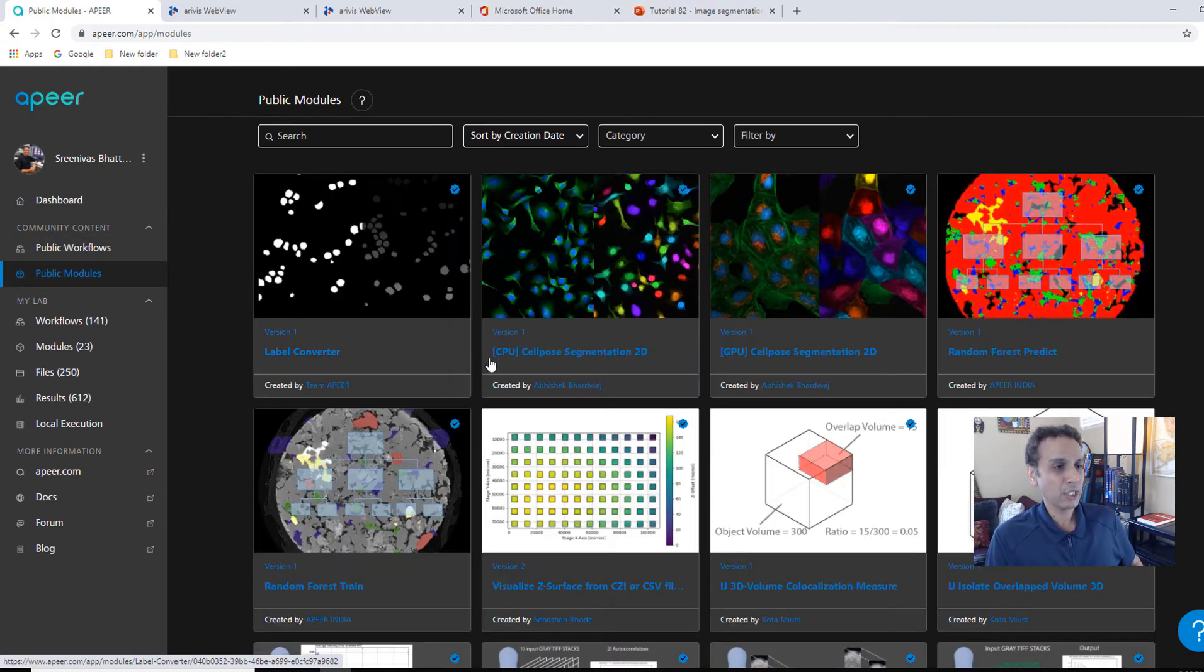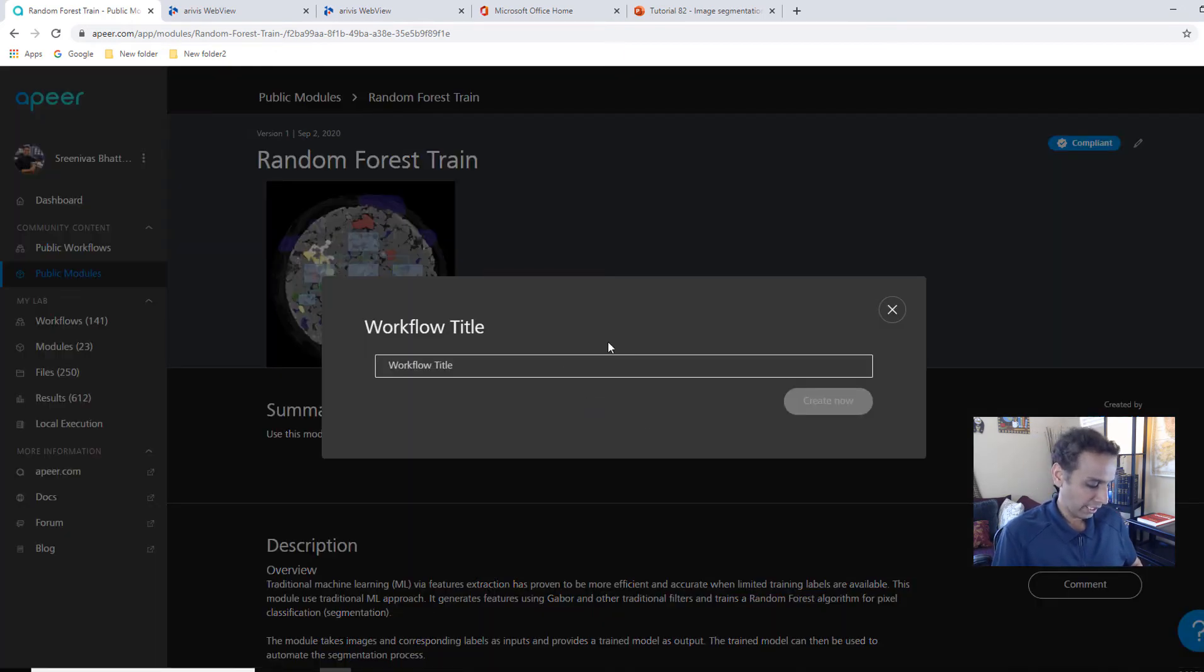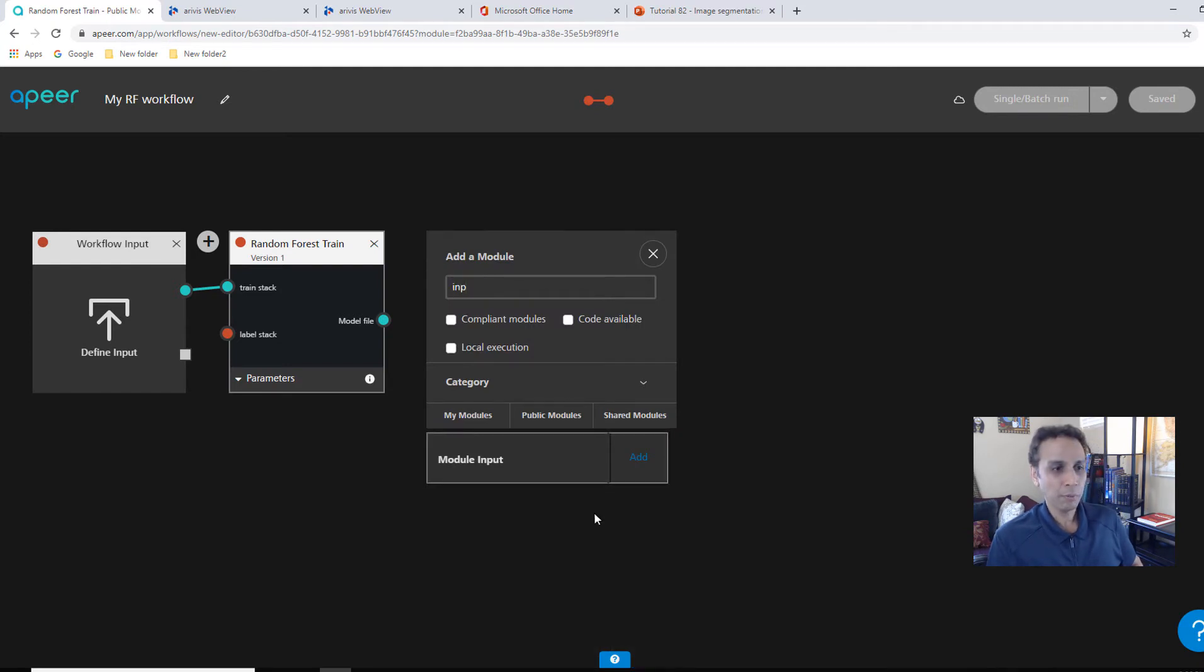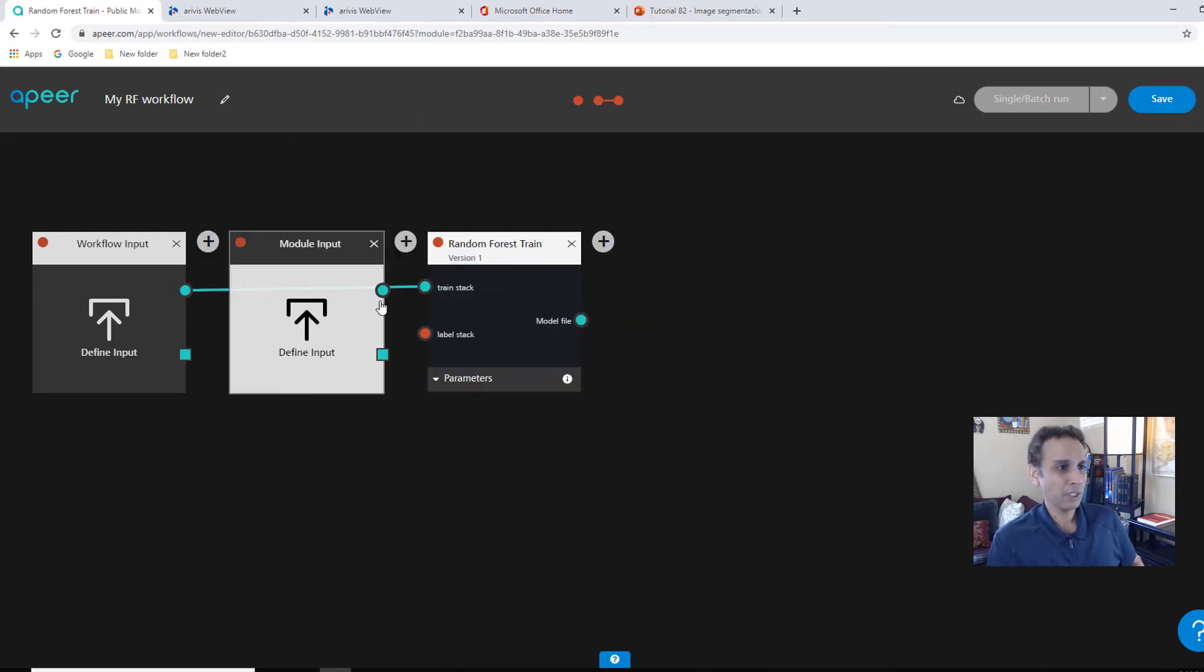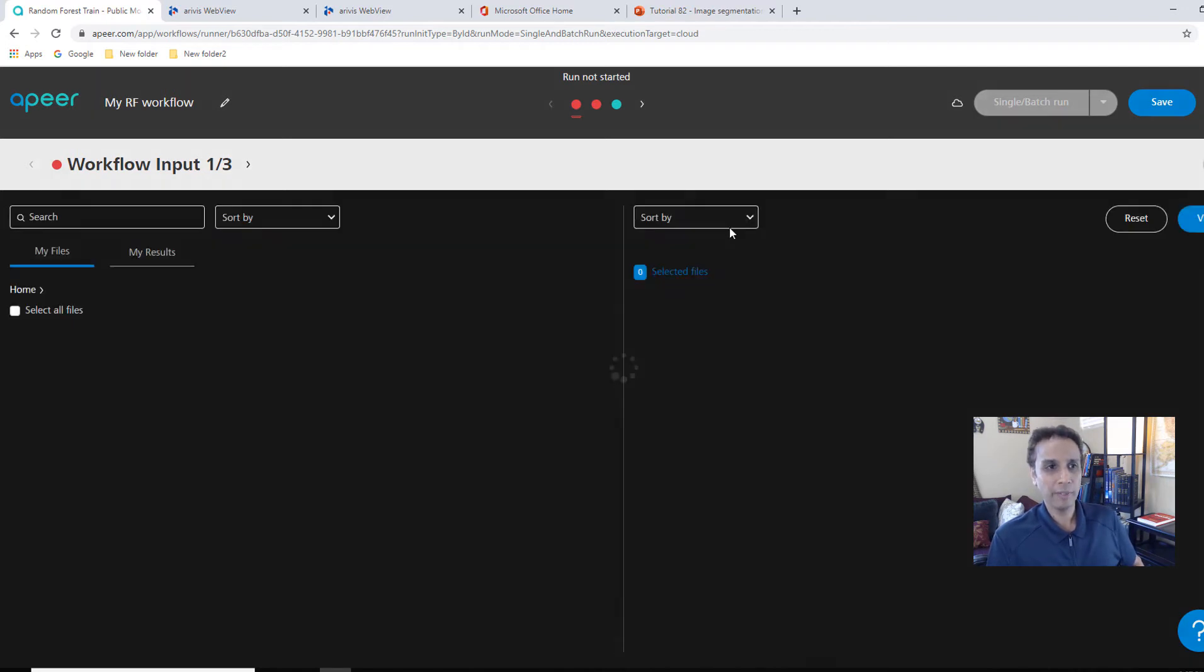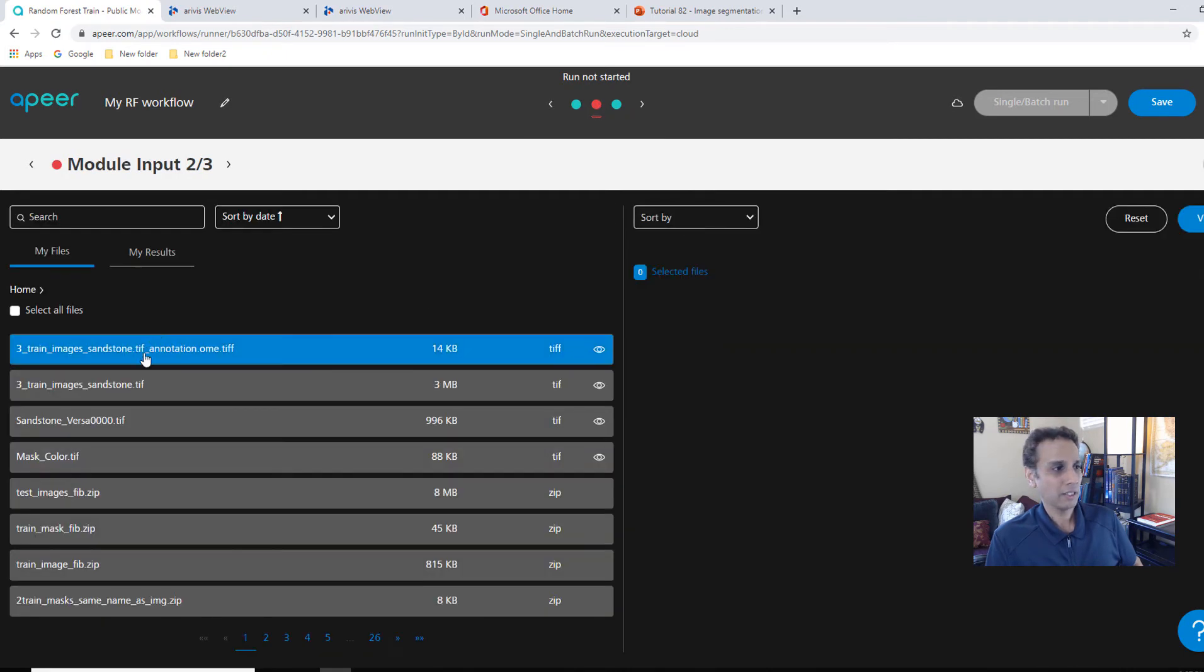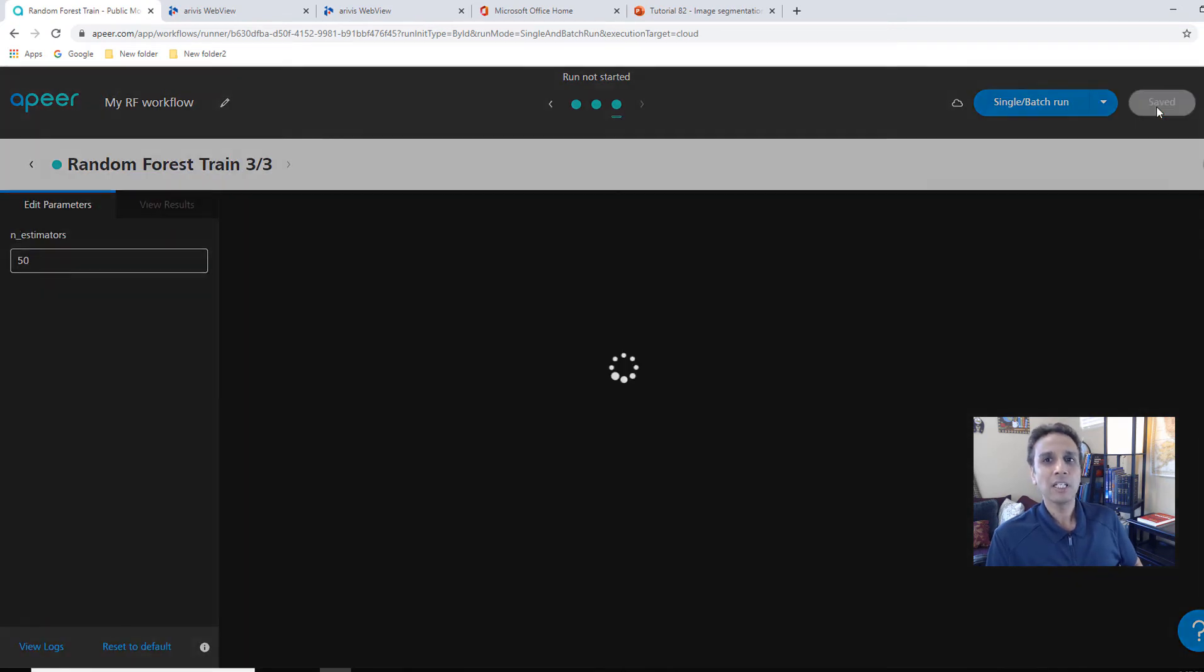By the way, you don't have to create this for this workflow. We already have it here. If I go to public workflows, image segmentation using random forest. If you click on edit, you'll see the structure right here. We have an input going as training stack. We have an input going for label stack. And then another input for test images and model file that gets created as part of training will be connected to the predict model. So I'm going to show you exactly how to create that. So let's go to public modules and start with the one that we know we absolutely need, which is the train. And now let's create a workflow.